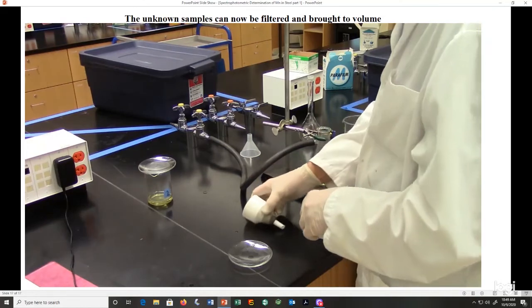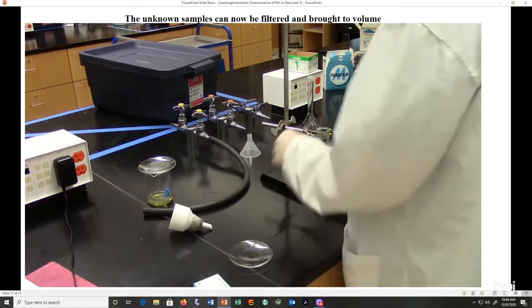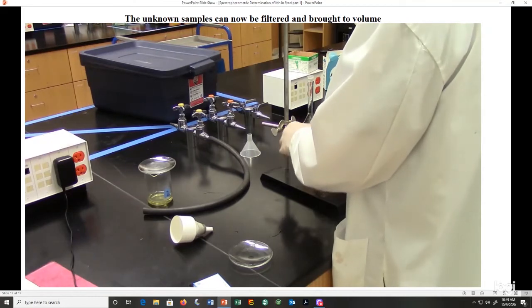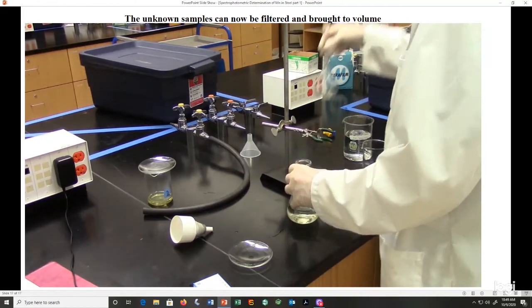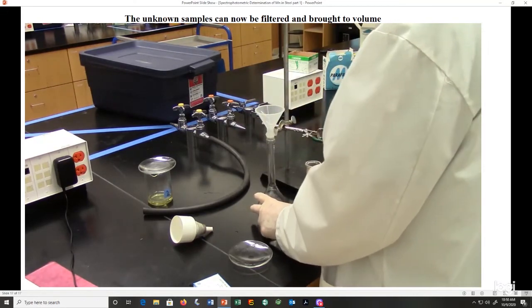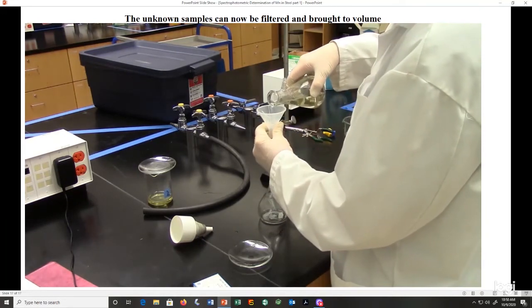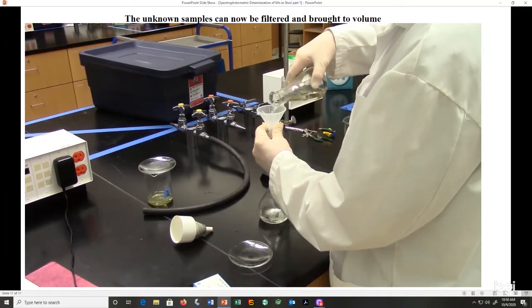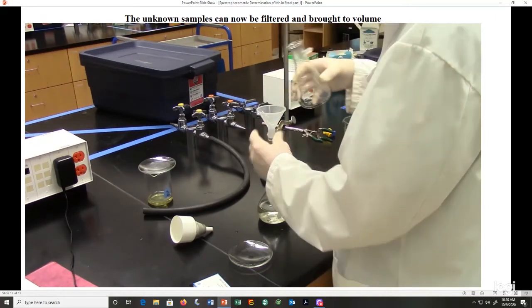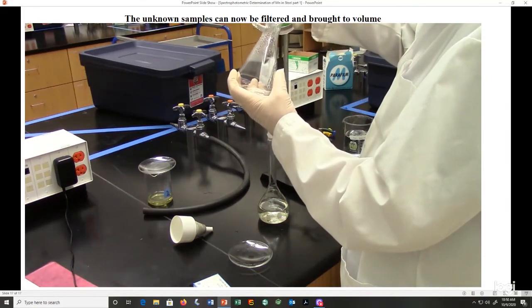Now we can take what's in the Erlenmeyer flask and transfer that to our 250 milliliter volumetric flask. We're going to use some of that dilute nitric acid again to rinse out our Erlenmeyer flask now.